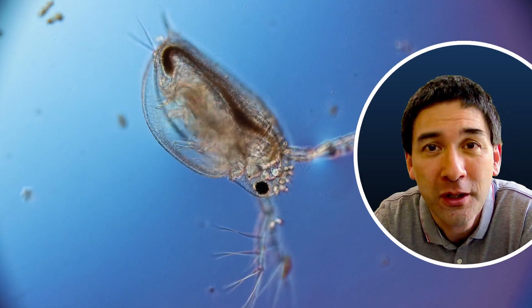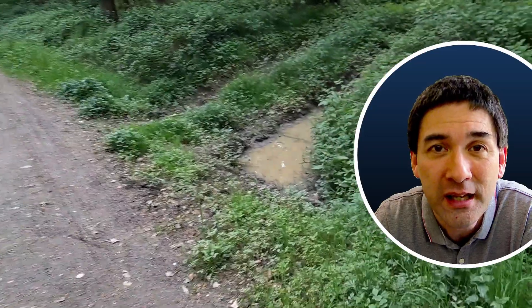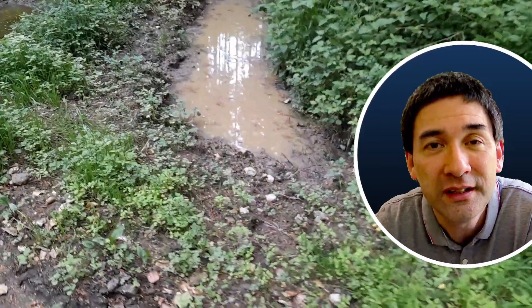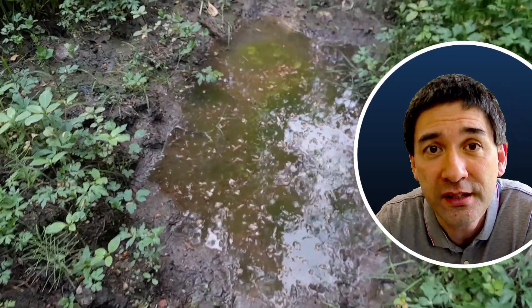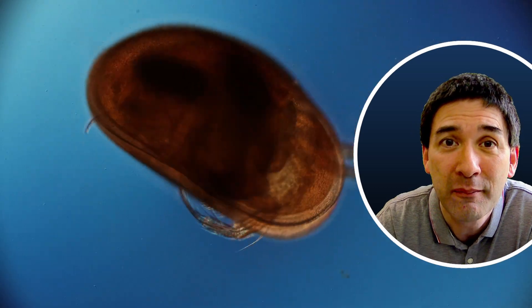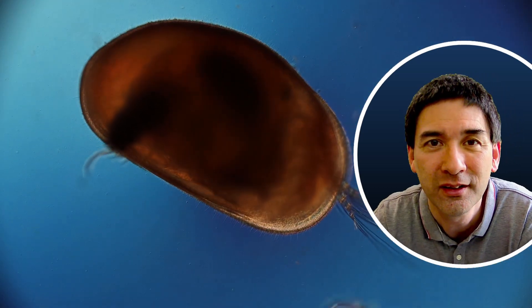There were quite a few of them in the water sample, and it all started at the beginning of May 2023 when I had a little walk in the forest. It was one of the first warmer days, and I saw these two puddles of water right next to the path. As a general rule, if water is standing there for approximately a week or two, that gives it enough time for water organisms to grow and thrive.